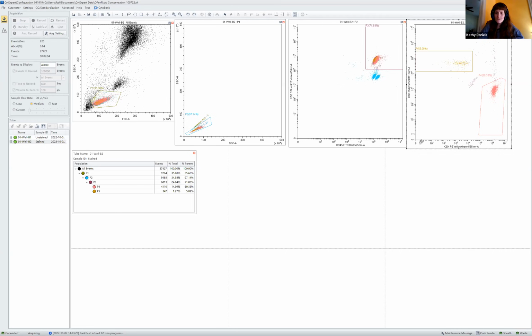So is there anything else we wanted to review today in CytExpert, or any questions that anyone had about this software specifically that we wanted to see? I know these aren't actual cells that we're looking at, but these are the TBNK controls and they look pretty good, right? We can see these different populations pulling out. And it's something I'm definitely interested in exploring for nice non-biological positive and negative controls for staining. So, something I'm pretty excited about, and also able to look at them to see how our compensation worked.